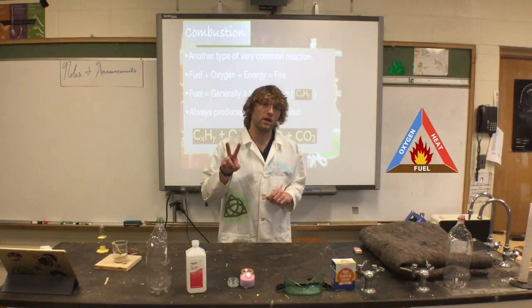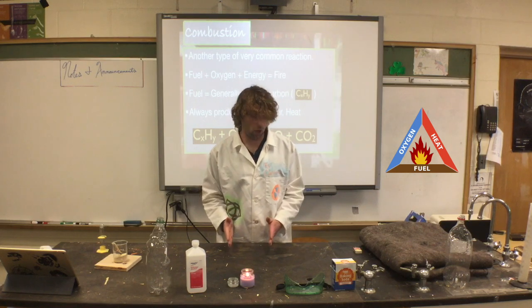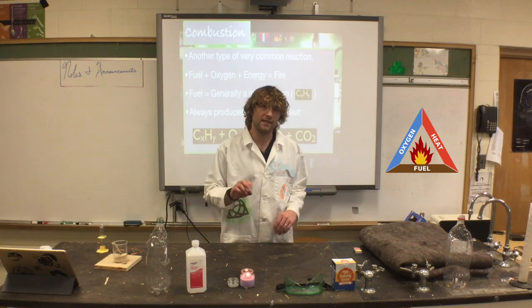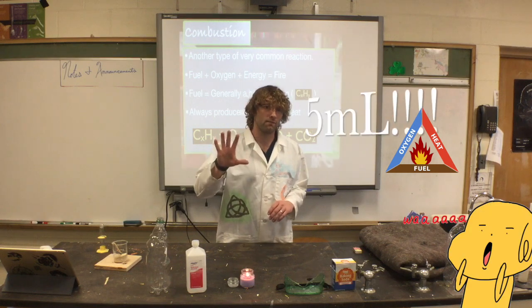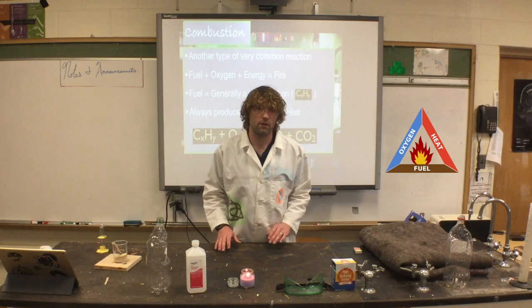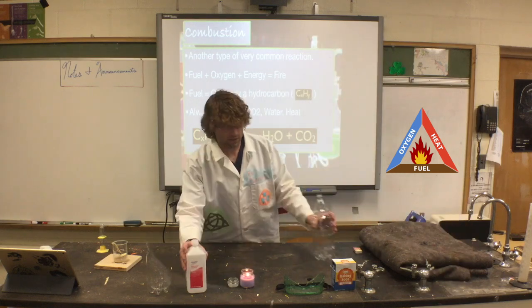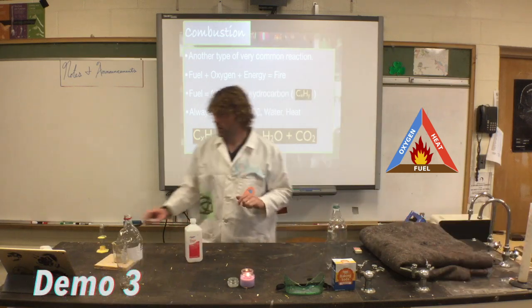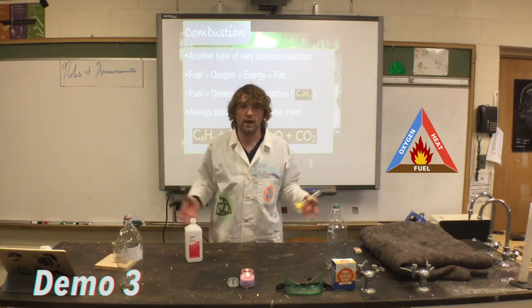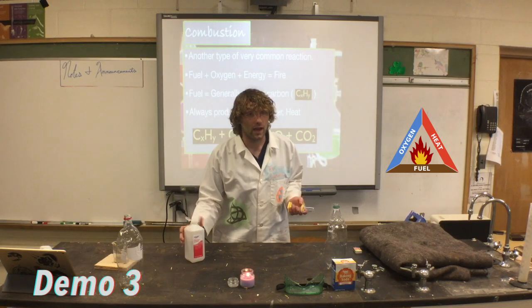Okay, so that was demo number 2. From demo number 1, I added 1 milliliter of fuel. You saw a very real effect with that bottle moving across the countertop. Then I did it again, but this time I added 5 milliliters of fuel. Same amount of oxygen, and you notice this last time we had 2.5 milliliters of fuel left over that went unburnt. So this time I'm going to add that same 5 milliliters, but instead of making sure I get it primed and get air in there and try to get some of the alcohol to evaporate, I'm simply going to light it and see what happens.